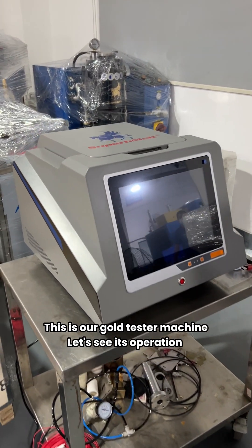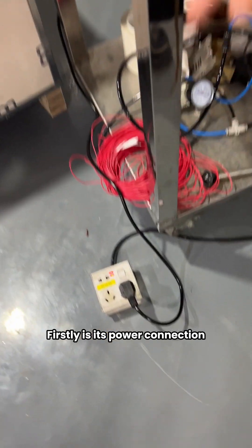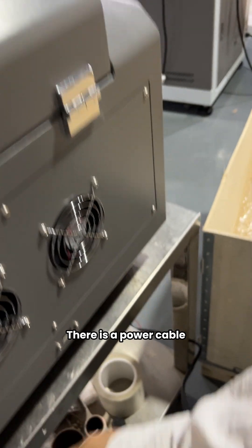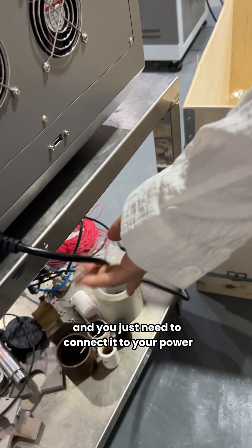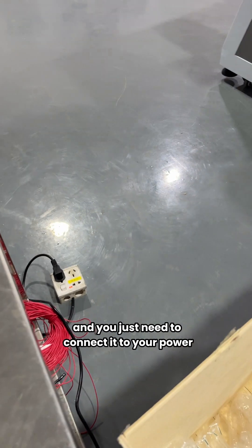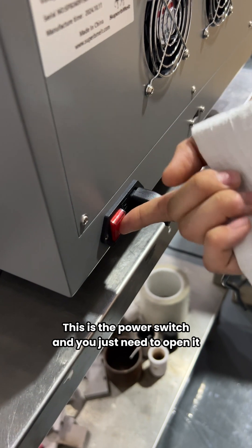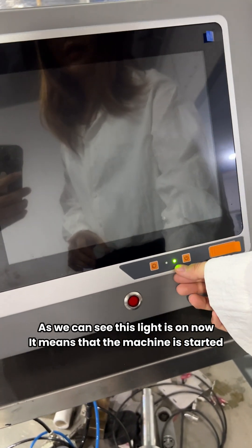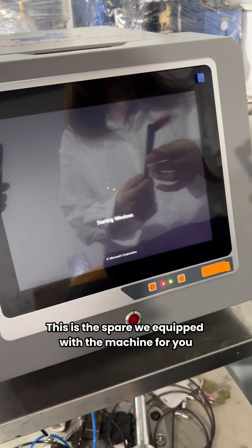Hello everyone, this is our gold tester machine. Let's see its operation. Firstly, this is the power connection — there is a power cable, and this is the power switch of this machine. You just need to connect it to your power, open the switch, and as we can see, this light is on now, which means the machine is starting.